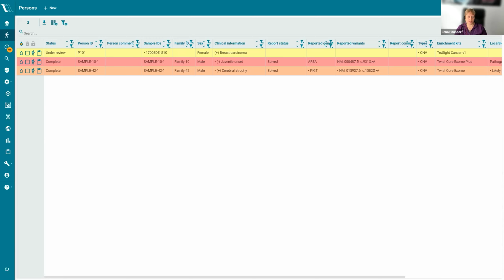For that, we have a research project together with the University of Rostock. So we are working on this right now, but it will take a little bit more time. And then we will also have a pre-selection like this, but at the moment not, because we have to be extra careful and need other precautions that other software companies don't need to take.